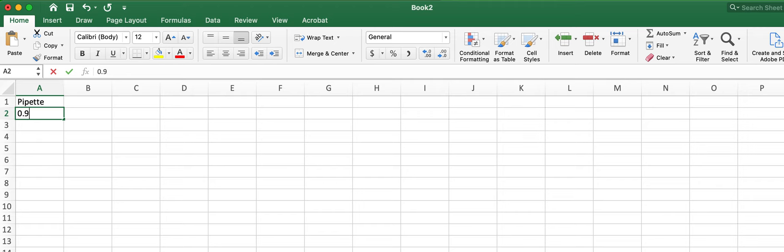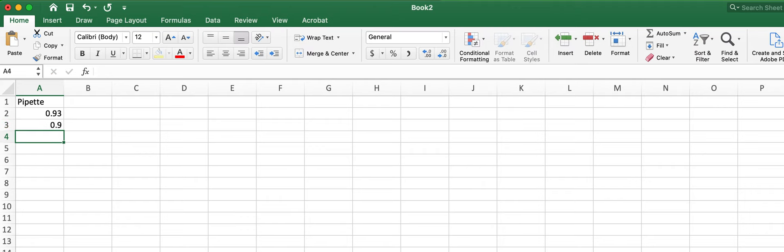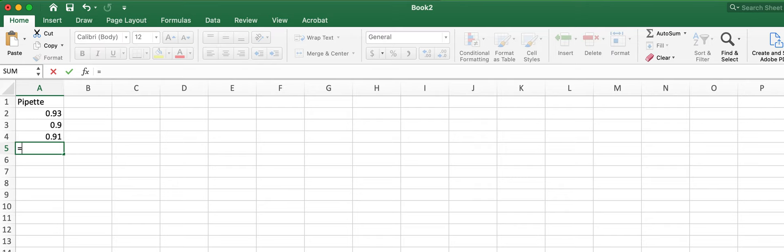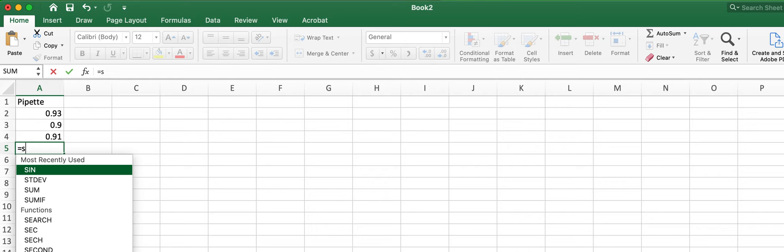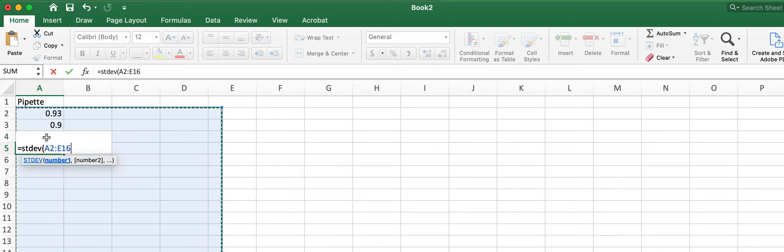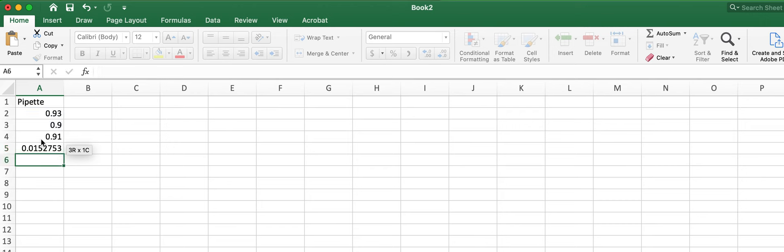So we're working on standard deviation of the pipette. I need my three values. And then the command in Microsoft Excel is equals to tell Excel that you're doing math. S-T-D-E-V, open parenthesis and then click and highlight all your numbers, all three of them, close parenthesis and then hit enter.